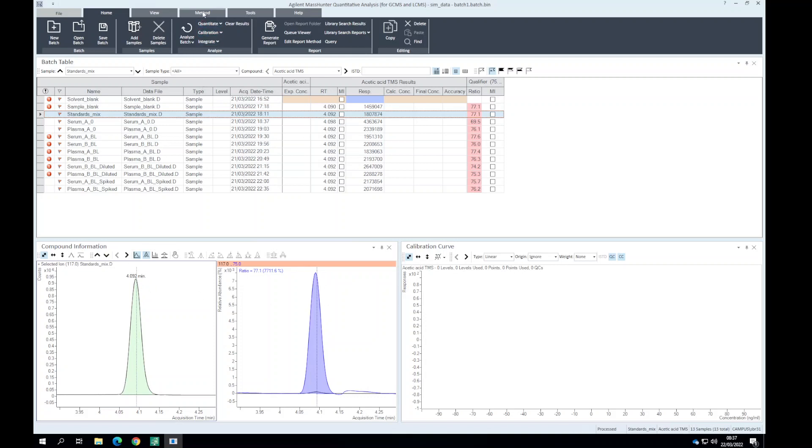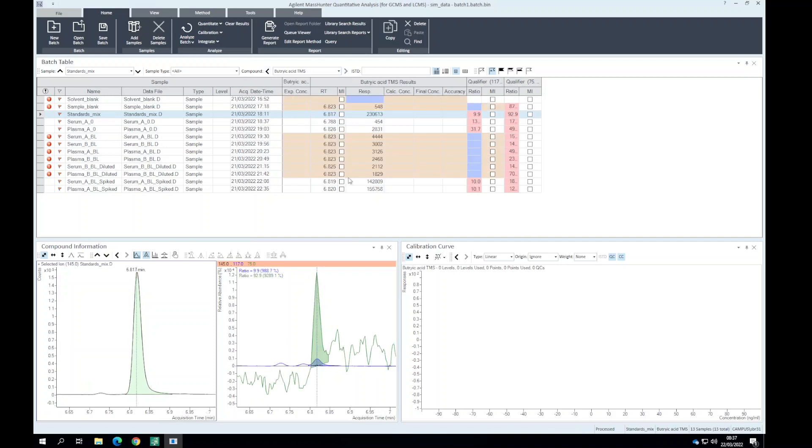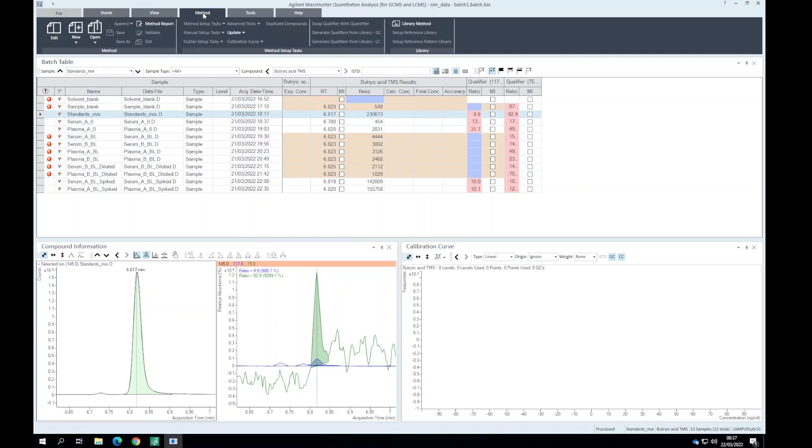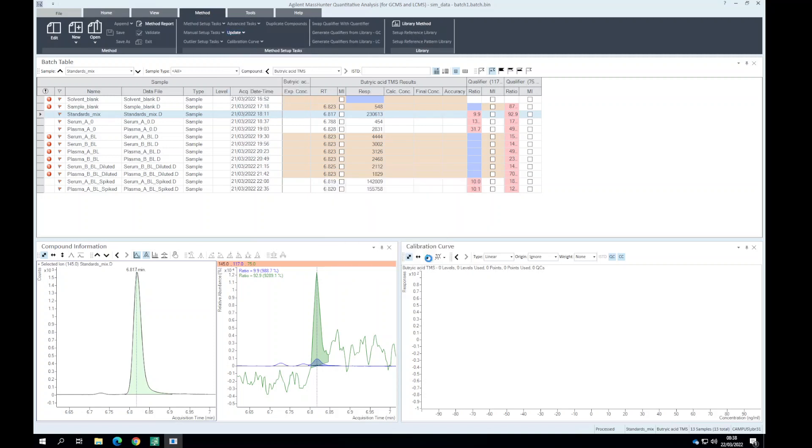While we're here we can look for consistency between the different analytes. For acetic acid and propionic acid we see there's a peak and there's a ratio, but we'll normalize these to make it look better. And then also for butyric acid. Let's update our qualifier ion ratios for all of these analytes.